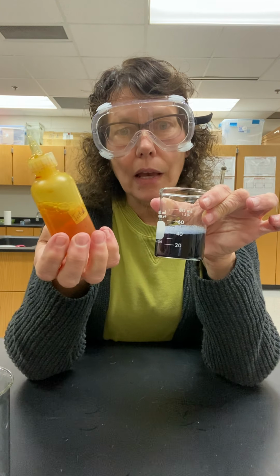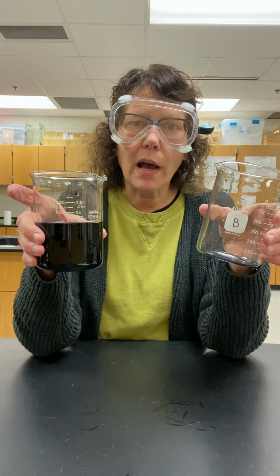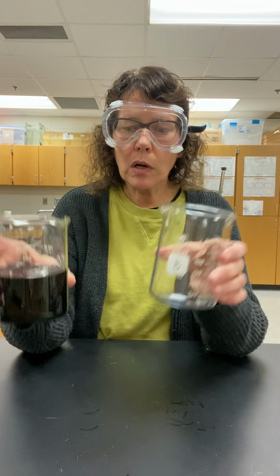All right, so iodine mixed with starch makes it turn this color. What makes this one so interesting, though, is that it stayed clear for a while and then suddenly, within a few seconds, it all changed color at the same time. So what was going on?